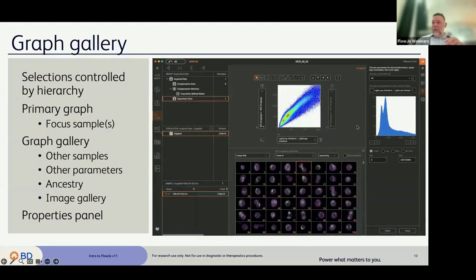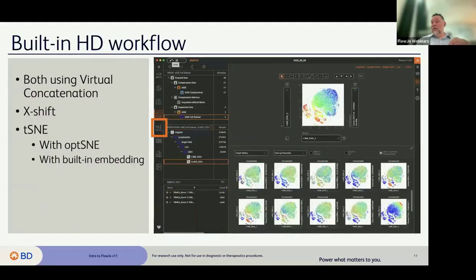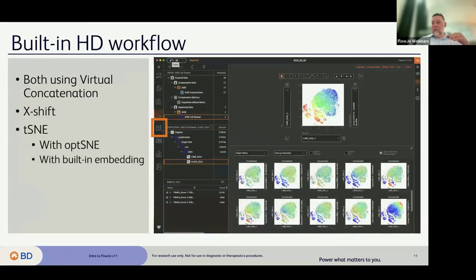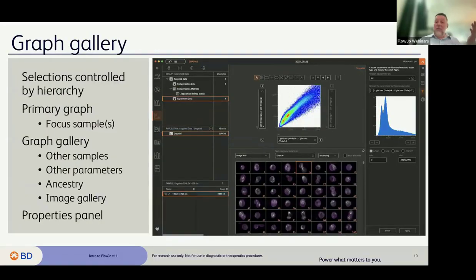So if we load some imaging data, you will notice that we can get all the images, and there are various features that we can deal with in the imaging wall here to adjust the views and the imaging parameters for each of the imaging channels, and the colors, the smoothing, and other imaging features.